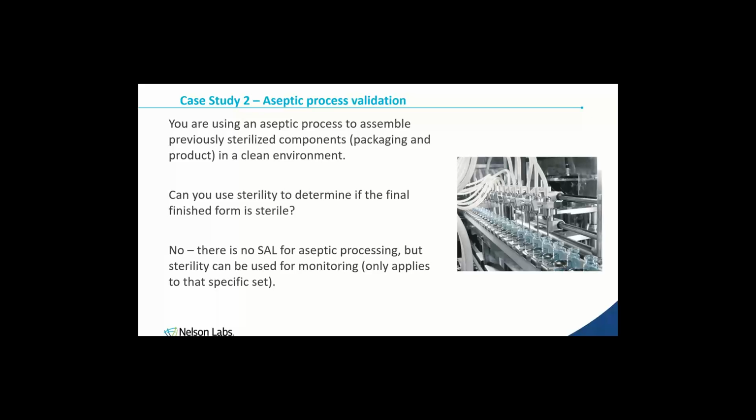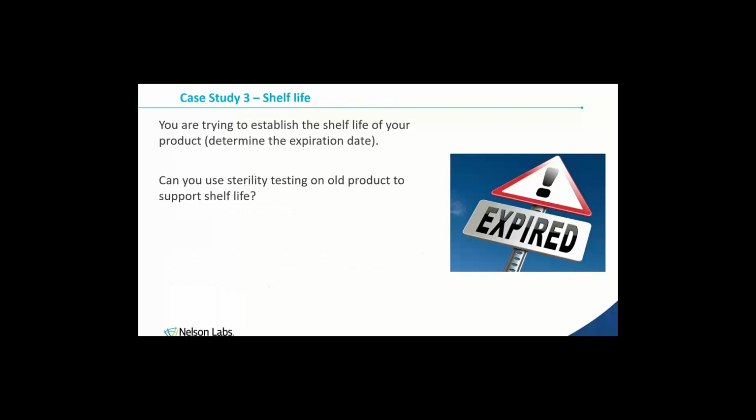You're looking at sample sizes 1,000 plus. And hundreds of thousands even. Sometimes, yeah. And then instead of filling it with your drug product, you would fill it with growth media and then just incubate all those. So you would be doing, sorry, real high volume. All right, let's look at another one.